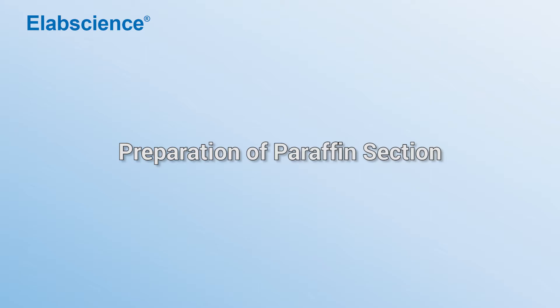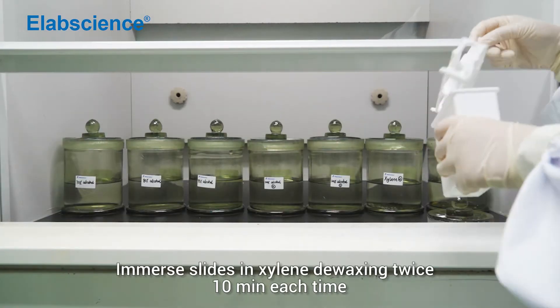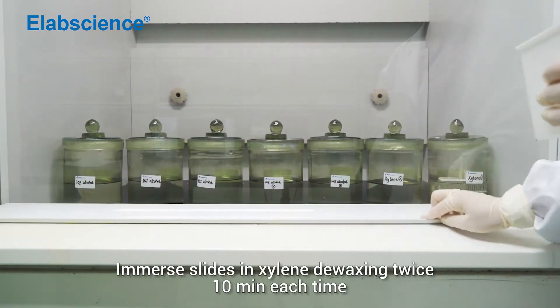Preparation of paraffin section. It must slice in xylene dewaxing twice, 10 minutes each time.